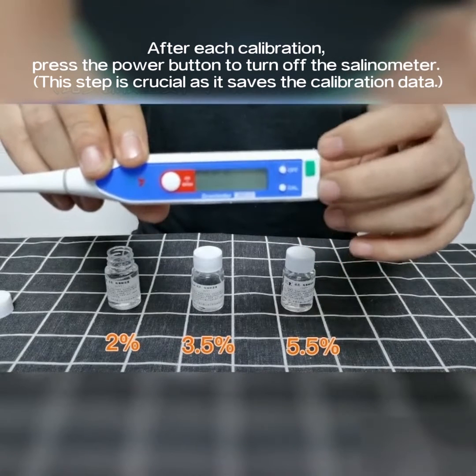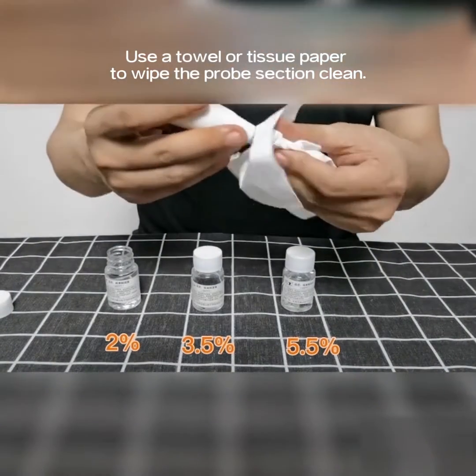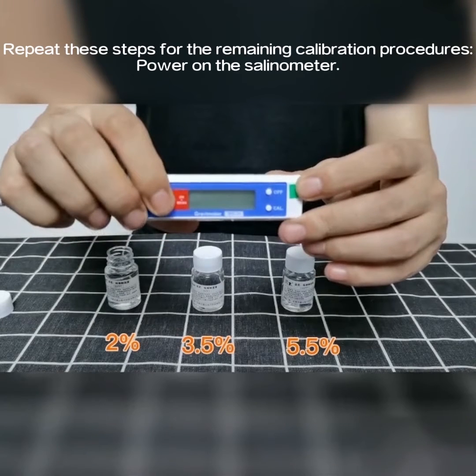After each calibration, press the power button to turn off the salinometer. This step is crucial as it saves the calibration data. Use a towel or tissue paper to wipe the probe section clean. Repeat these steps for the remaining calibration procedures.